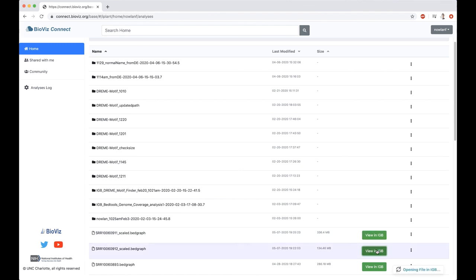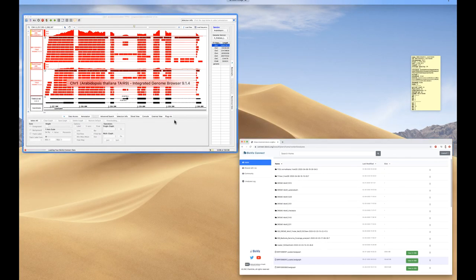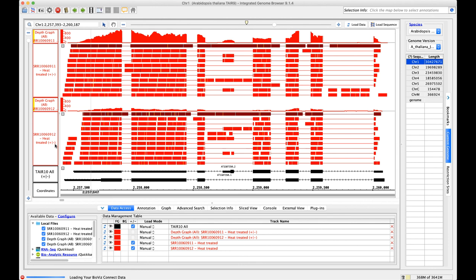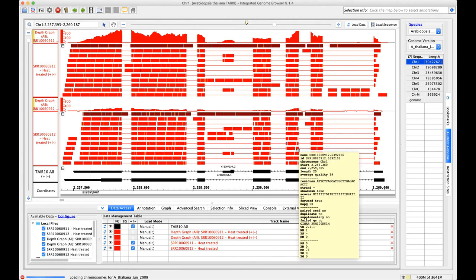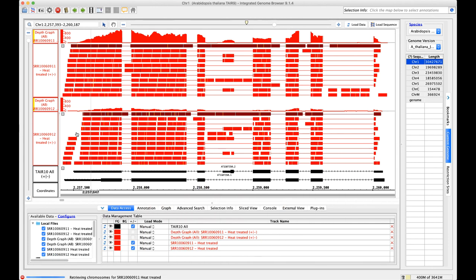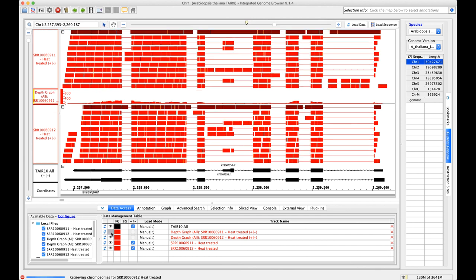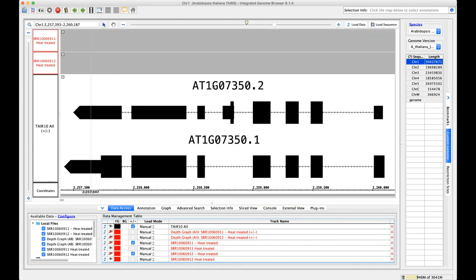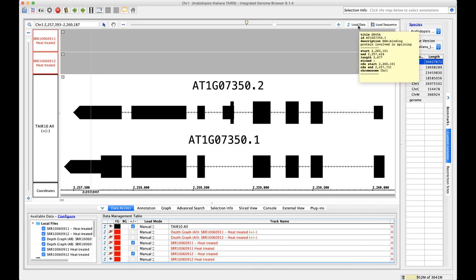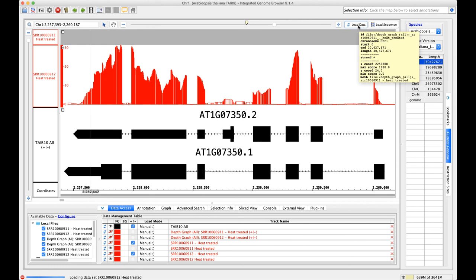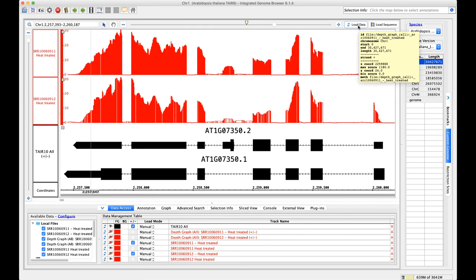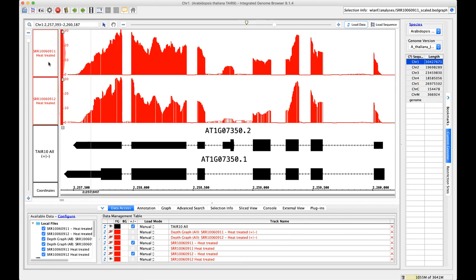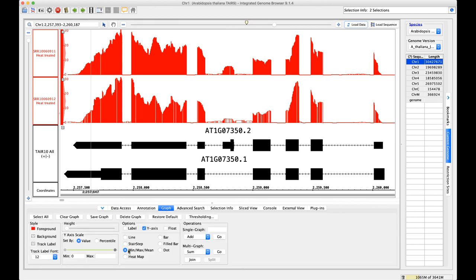Do that for both of them. Let's jump to IGBE and let's get rid of the current data that's in there. Our data have been added as new tracks. And I'm going to go ahead and load that data. And then we can shift click graph and make sure these are on the same Y axis.